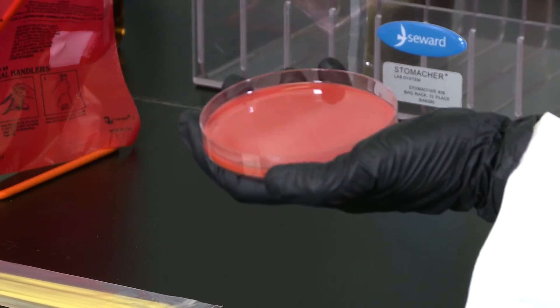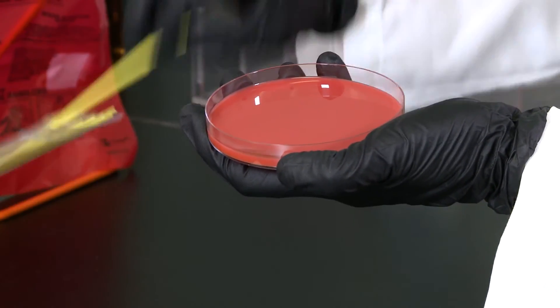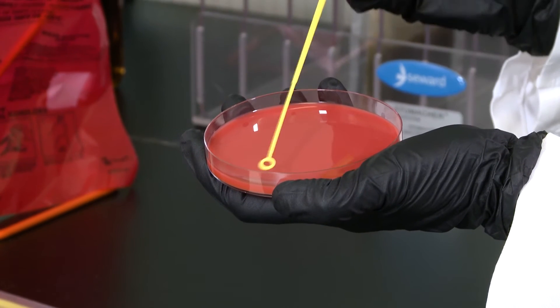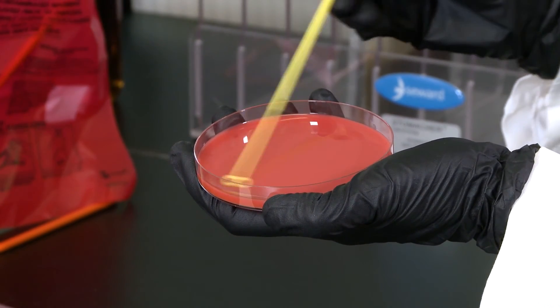Using a sterile loop streak across half of the agar surface going backwards and forwards twice. The goal is to spread the liquid as completely as possible across half of the agar.